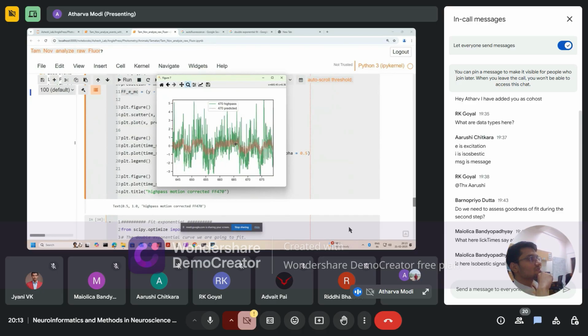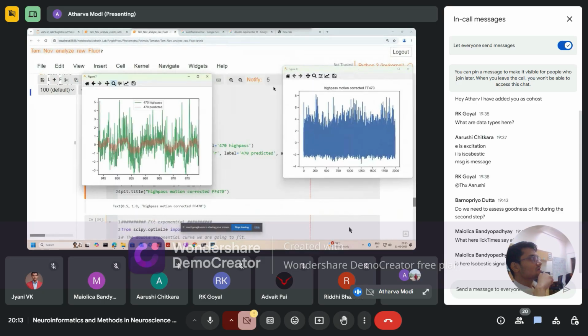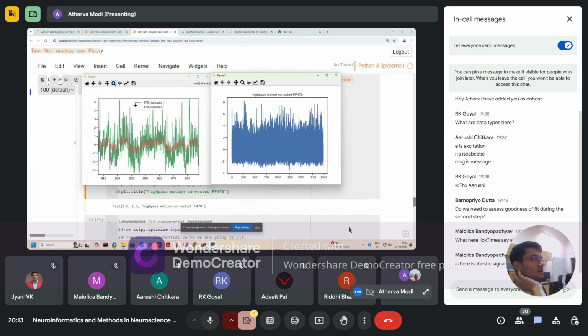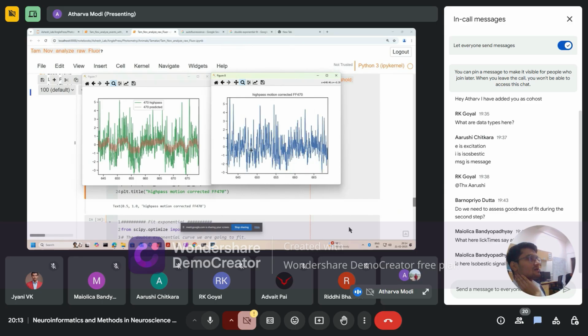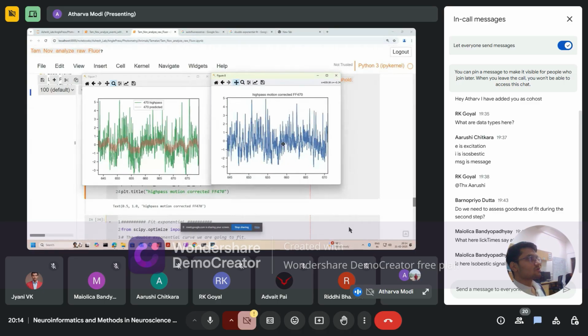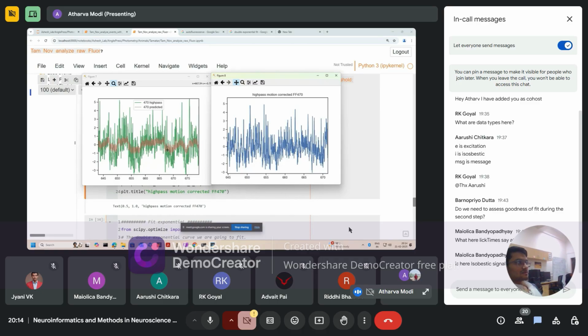So these were the kind of changes that you were seeing before motion correction. Focus on the green one, that is our excitation signal. Now if I zoom in here, those signals should go away. So these kinds of changes that you were seeing, this particular increase, this basically low frequency wave, that wave is somewhat still there, but more or less gone. Some of them might actually be true signal that may still be present, but the pattern is not there anymore.